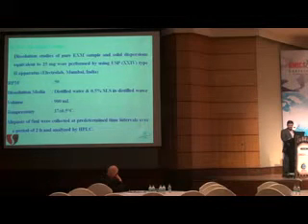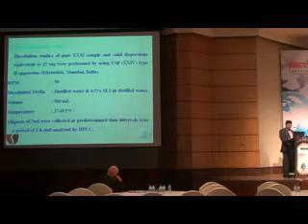The scanning electron micrographs were taken to understand the morphological information of the formed solid dispersions and pure drug.